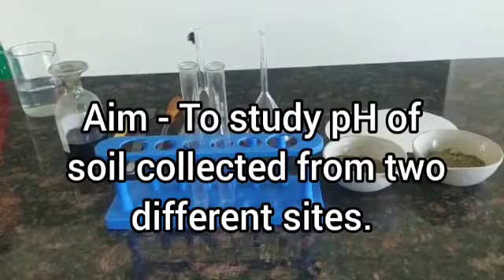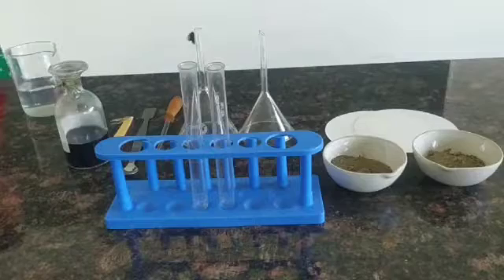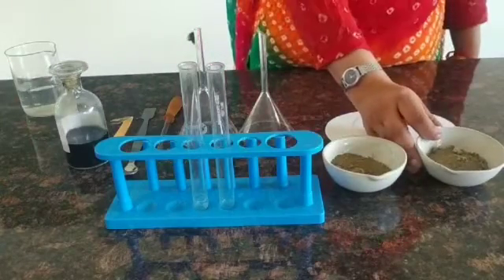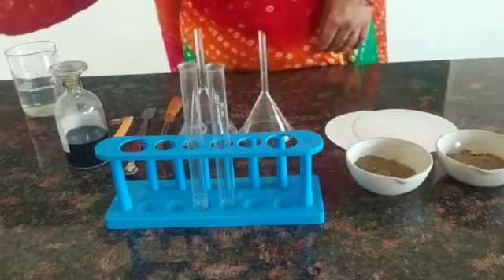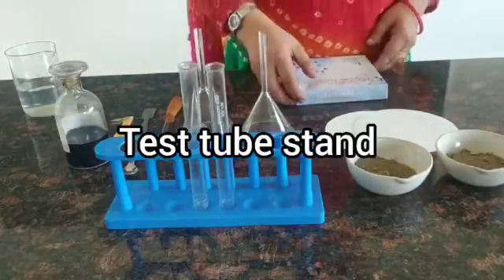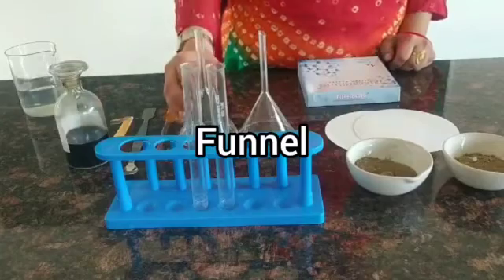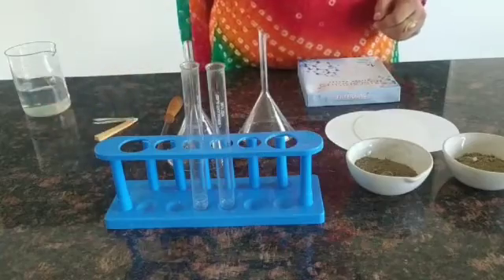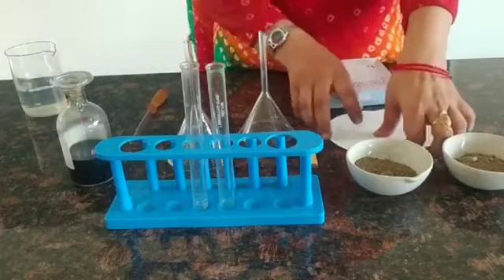To study the pH of soils collected from two different sites and study the kind of plants found in them. Materials required: soil samples — garden side soil and roadside soil, test tubes, test tube stand, funnel, spatula, universal indicator, pH paper, dropper, and filter paper.